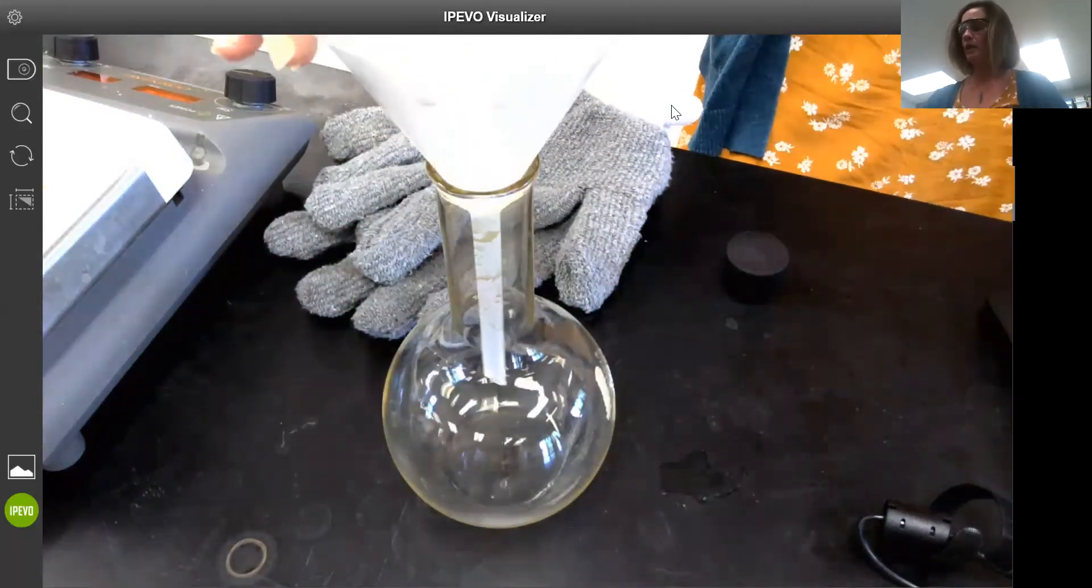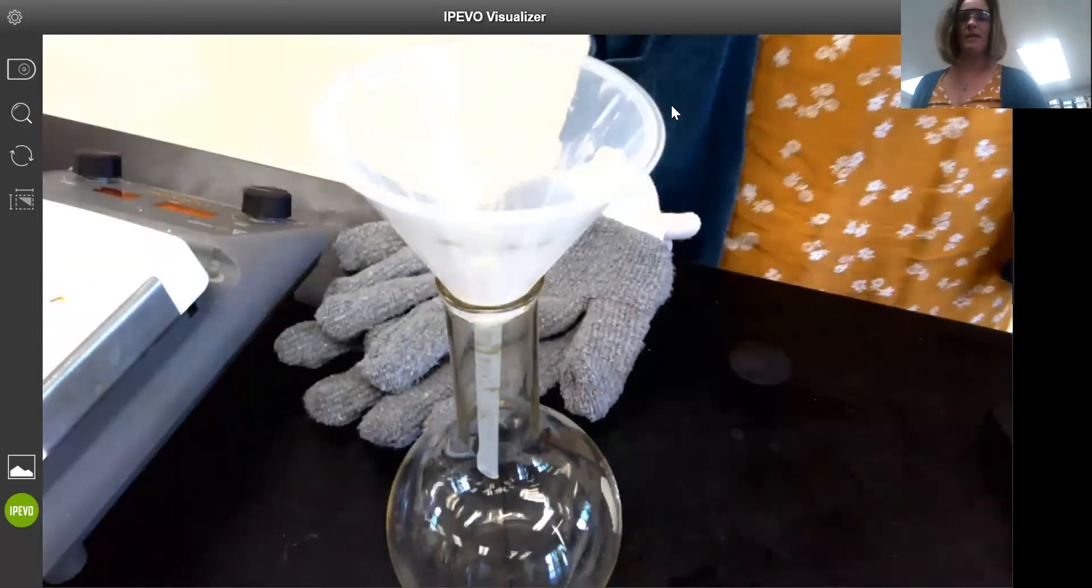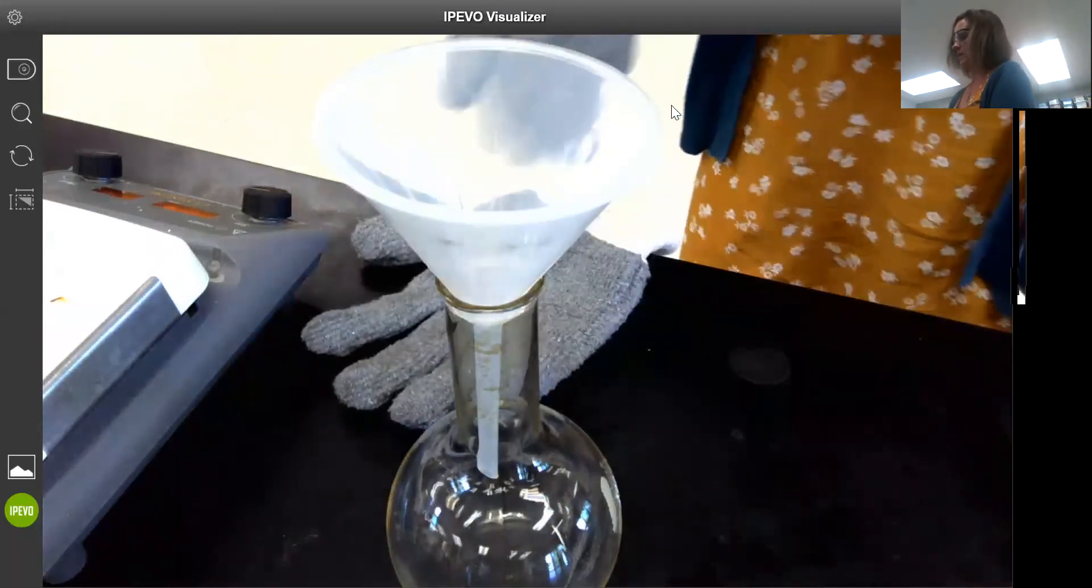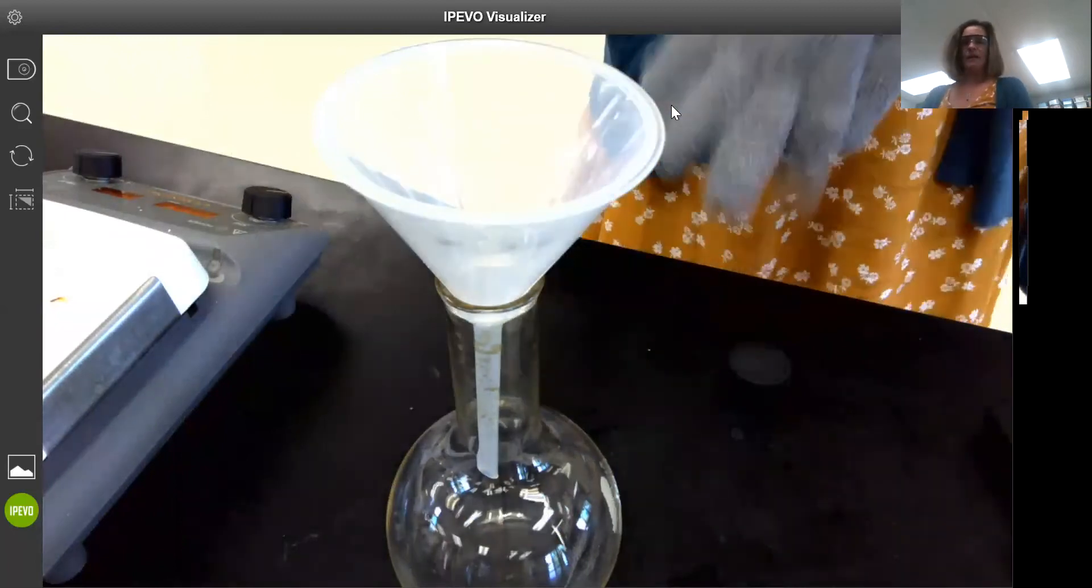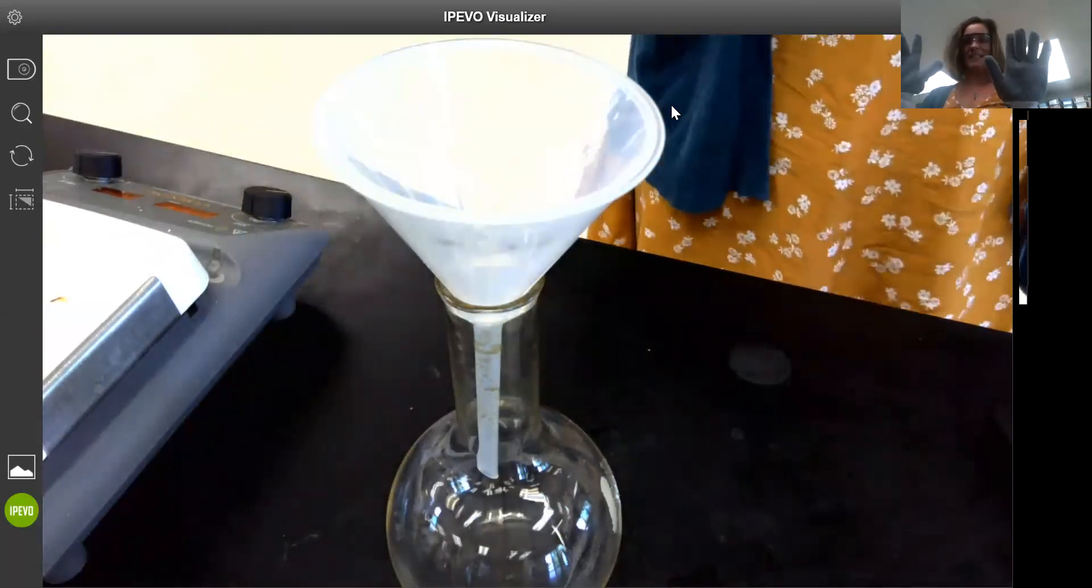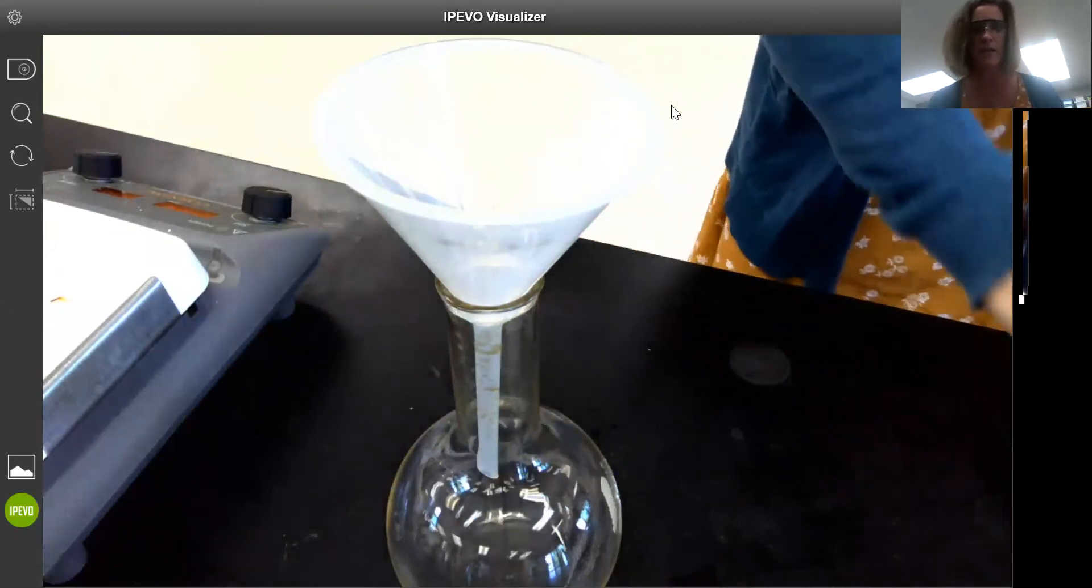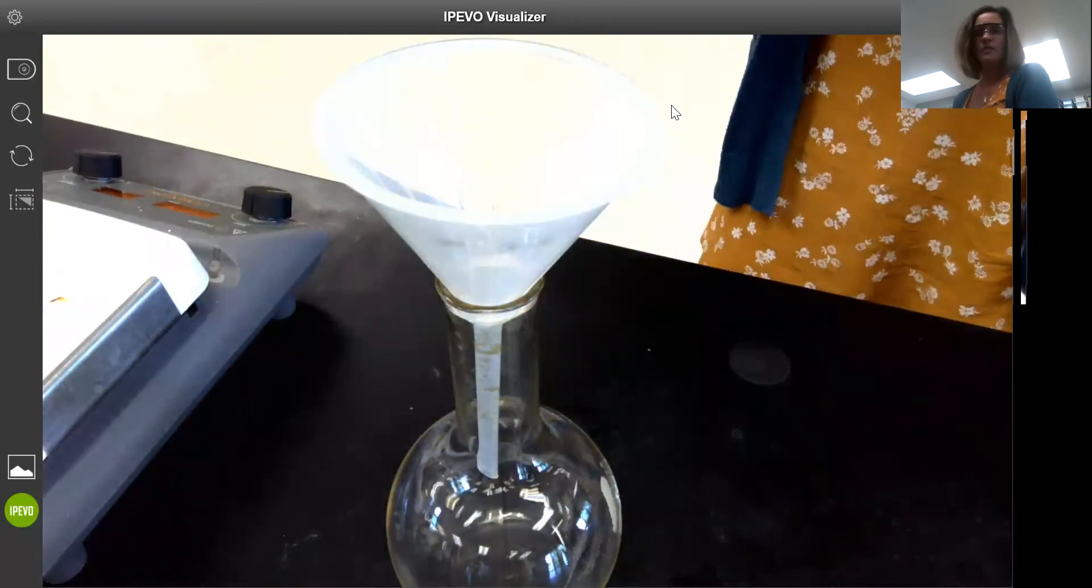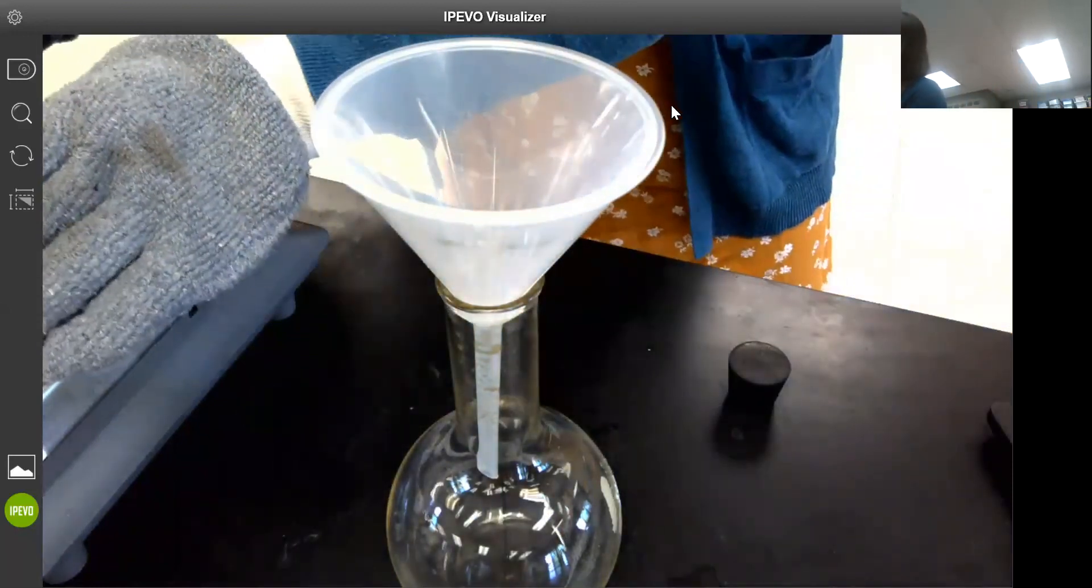I'm just going to use a funnel, a liquid funnel, for transferring the liquid from the beaker into the Florence flask. I'm going to turn my stirring off over here on the hot plate. You can see I'm putting on some heat resistant gloves because this was heated to 90 degrees so that'll be hot to the touch.